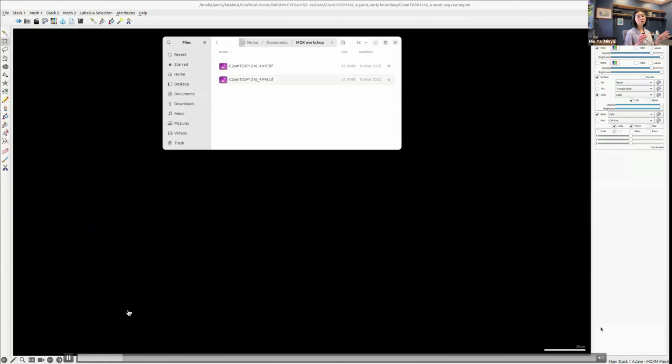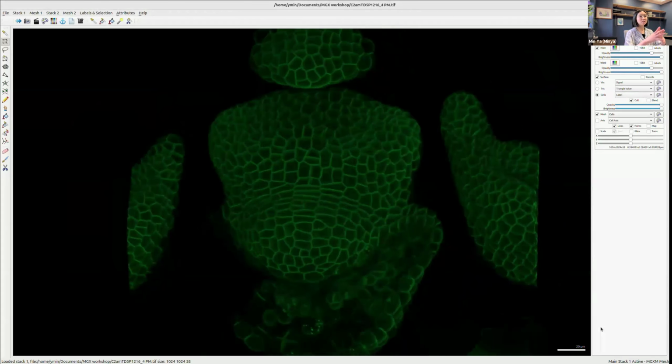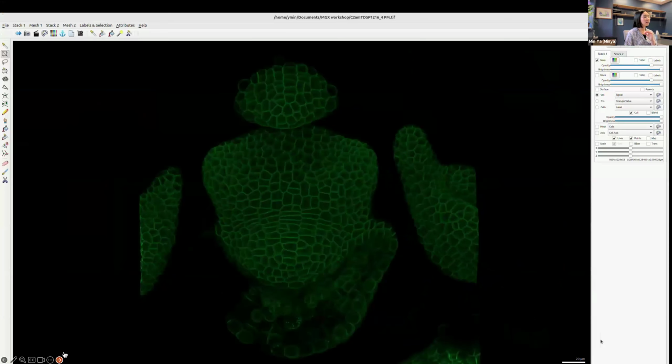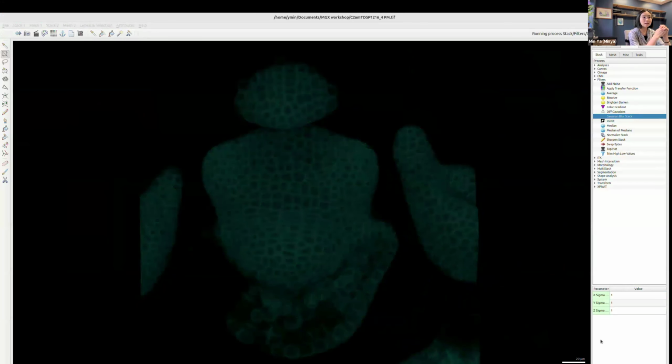So for my confocal, we collected 3 channels, the blue, the red, and the green. And here I separated the blue one and the green one, and you just drag the plasma membrane line directly inside. You can see this beautiful 3D constructed tissue already. So after that, our first step is to extract the surface, the shape of the tissue, which we start with by blurring them multiple times. So these are the parameters that you can choose and optimize for your own samples.